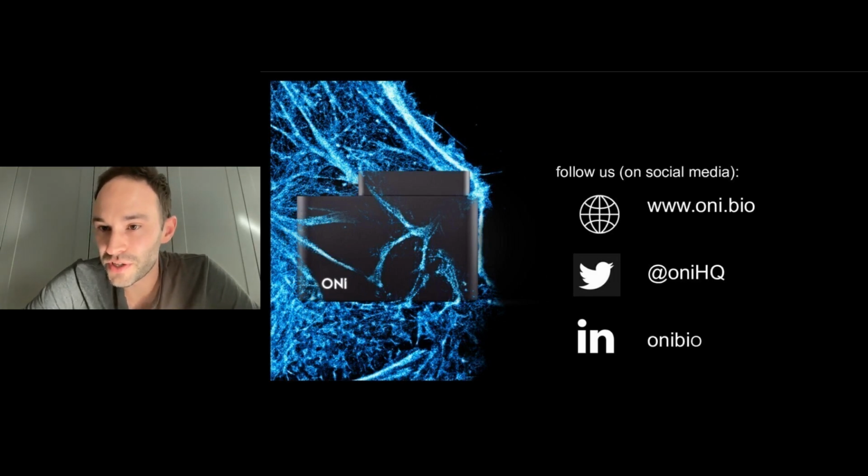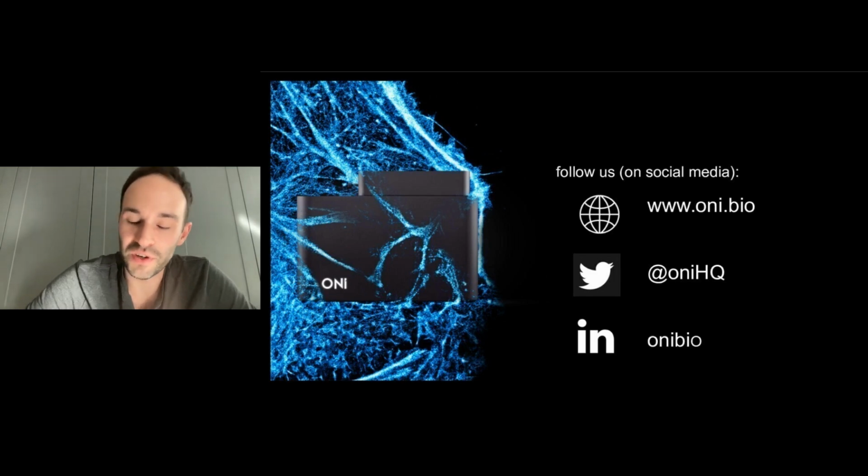So there's a question here, which is, I'll quickly answer this question about the subpopulation, because that's related to the last one, and then I'll come back to the vibration table. So the question is, does the kit miss any subpopulation of EVs? The short answer to that is not really. We generally capture in a way that's pretty agnostic to the biomarker composition of the EVs. However, it is in principle possible that depending on the sample, there could be subpopulations that have never been encountered and would not be captured as efficiently as others.